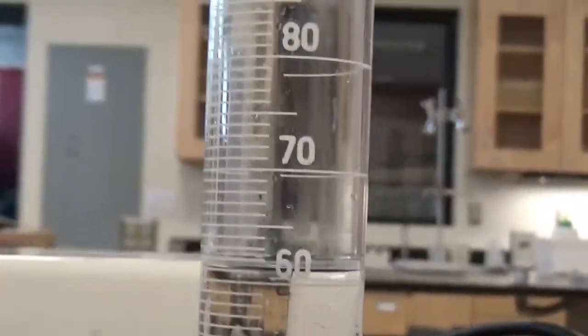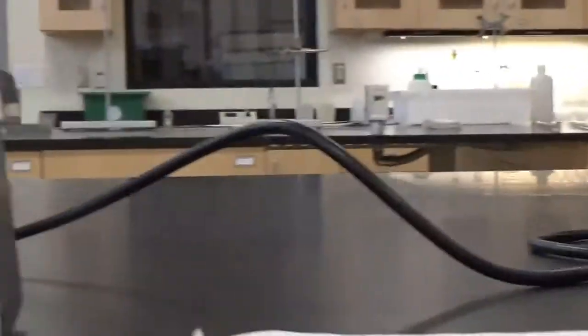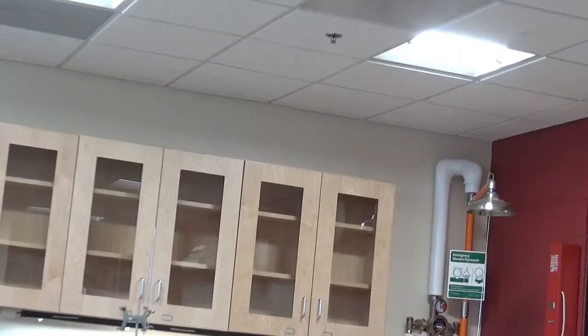Now I have to get the total volume. Looks like it's a little above 60, it should be. 62 maybe. So it looks like it's between 61 and 62. I'm going to try to get it better. I say it's 61.2.